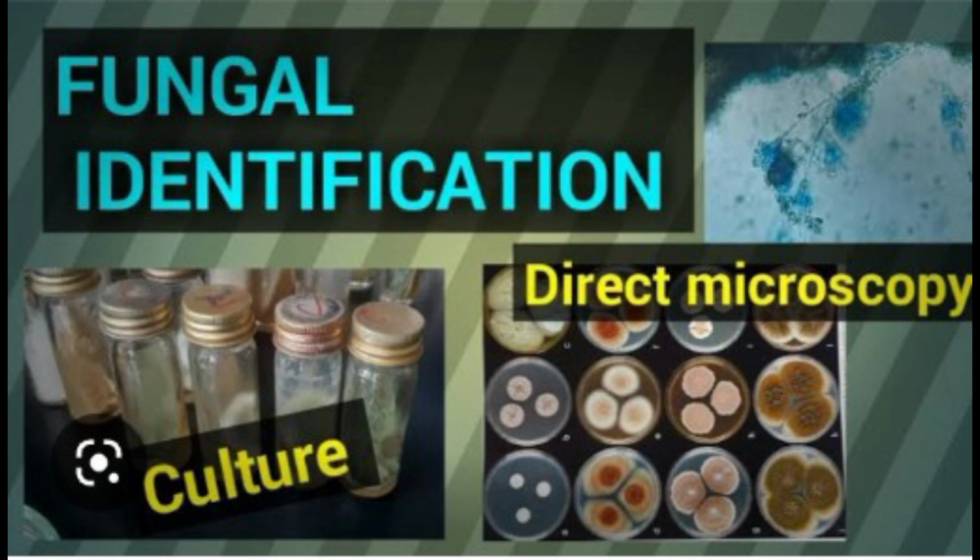Indian ink preparation. Indian ink staining is used to demonstrate the capsule of some yeasts and certain capsulated bacteria. It is a negative staining technique. It may be used for direct demonstration of capsulated microorganisms, yeast and bacteria, in CSF. Requirement: CSF or yeast growth on SDA, Indian ink, glass slide, cover slip, wire loop, spirit lamp, microscope.